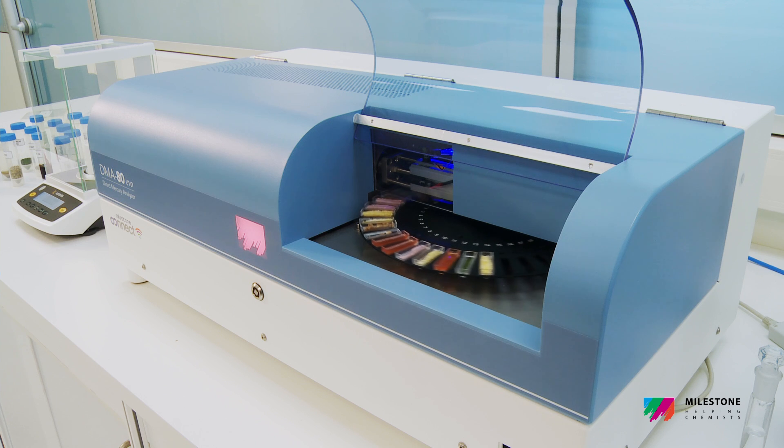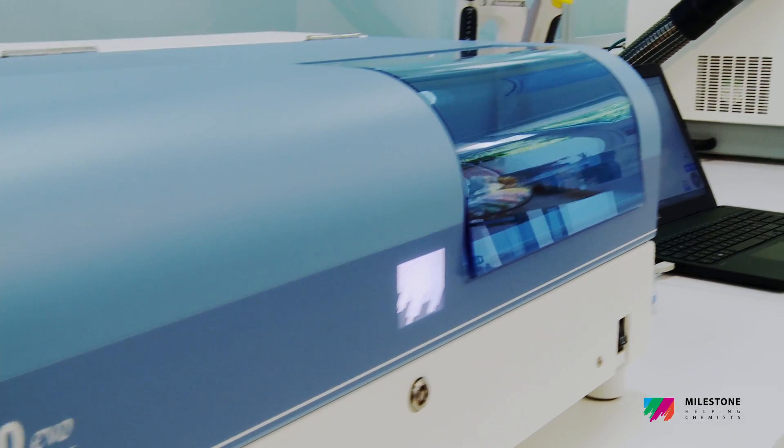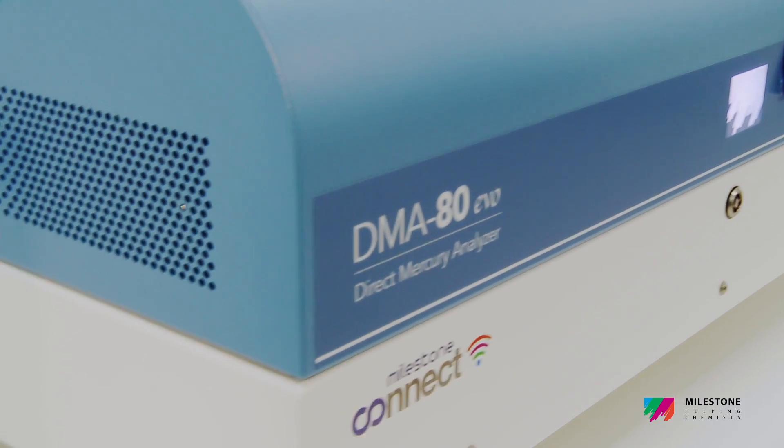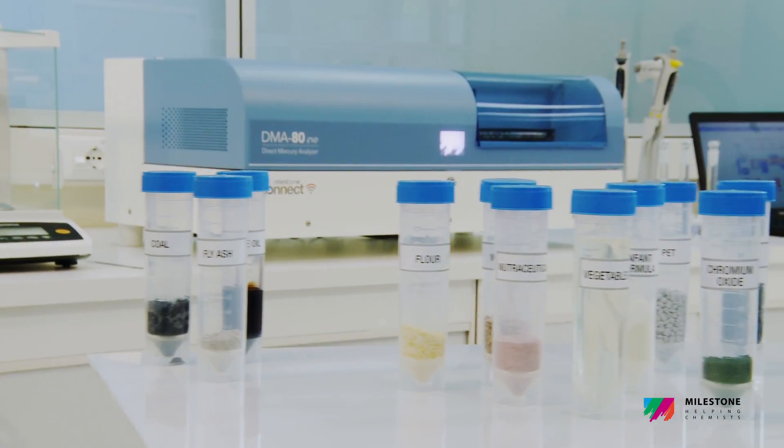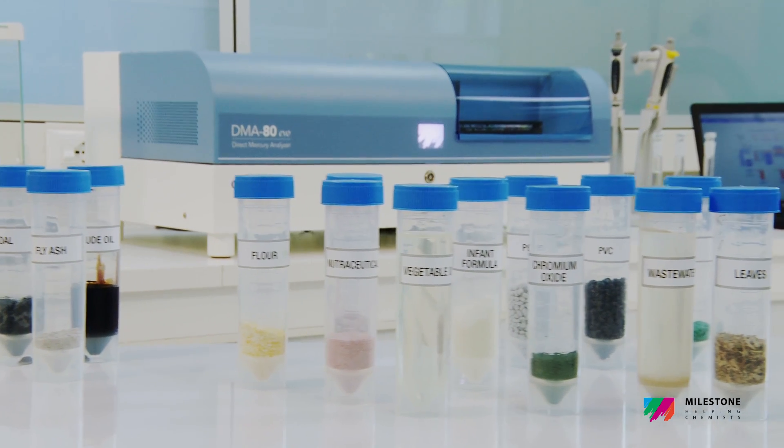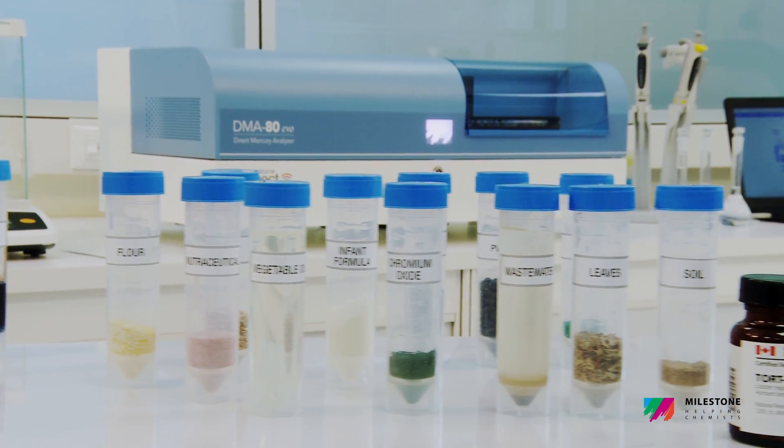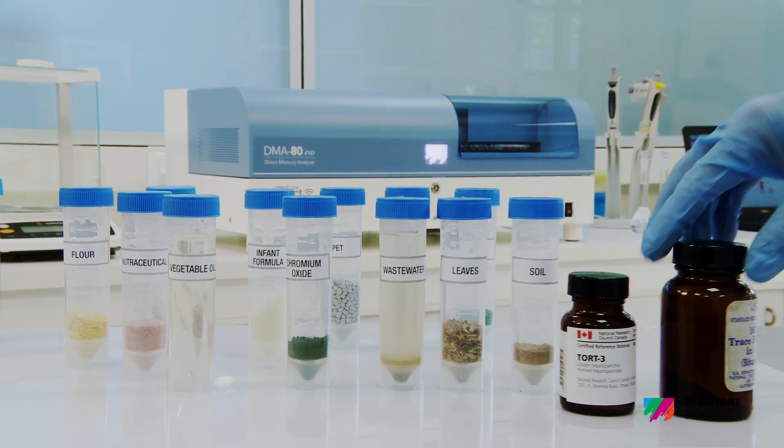Since the DMA80 EVO is used for mercury determination, it has seamlessly integrated into a wide range of applications and industries, such as environmental, energy, petroleum, food, cement, cosmetics, agriculture and mining, among others.